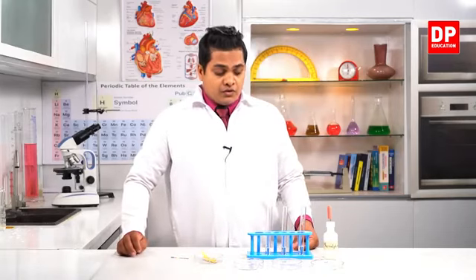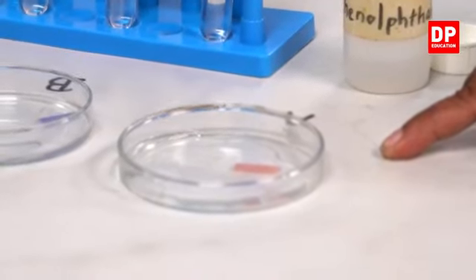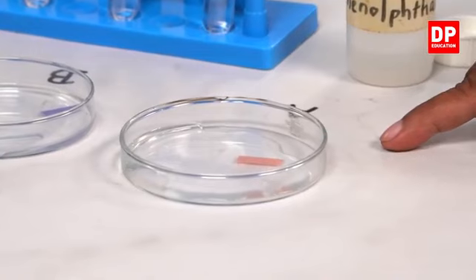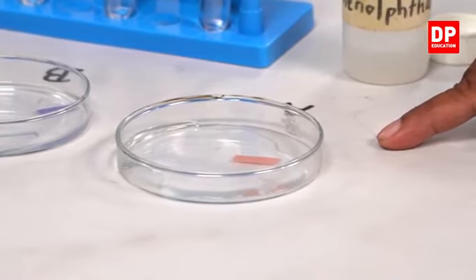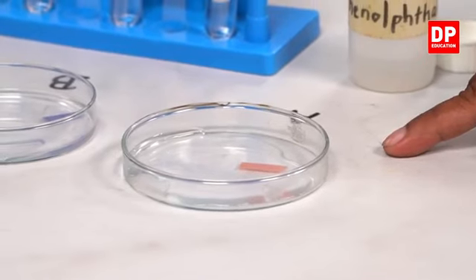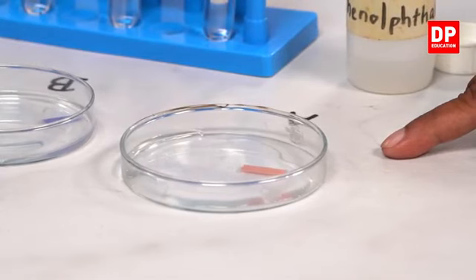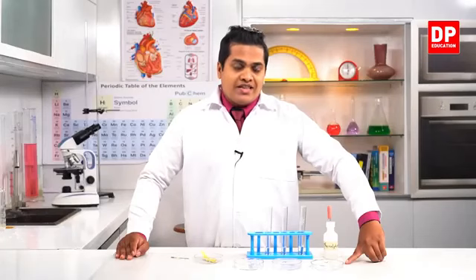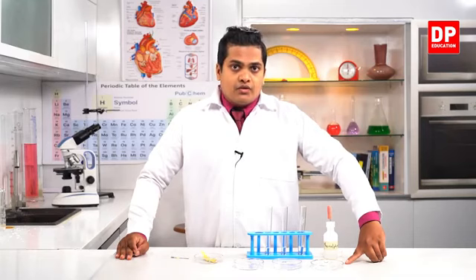Now I am going to take each of these litmus papers. When you take these acidic solutions, it's not wise to touch these solutions with your bare hands. But in these cases, we have added water and we have diluted the solution very well, so it's not that risky. But remember, it's not wise to touch these chemicals with your bare hands. Okay? Remember it, my dear children.